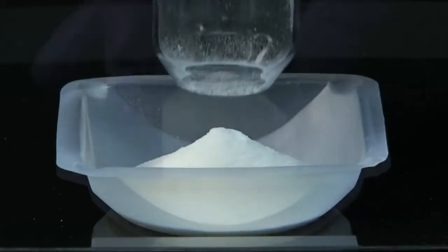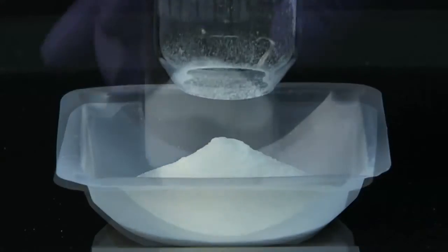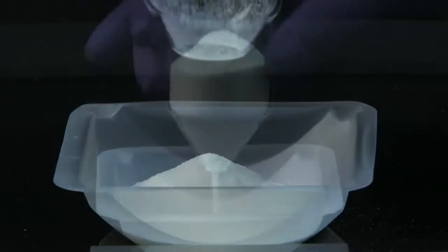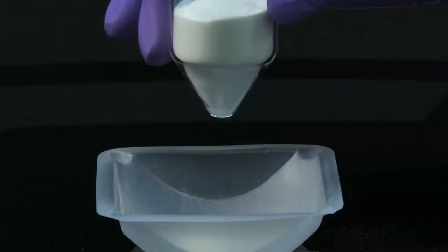Powder is poured through a series of six cylinders, each with a progressively smaller opening until it no longer flows freely through a cylinder opening.